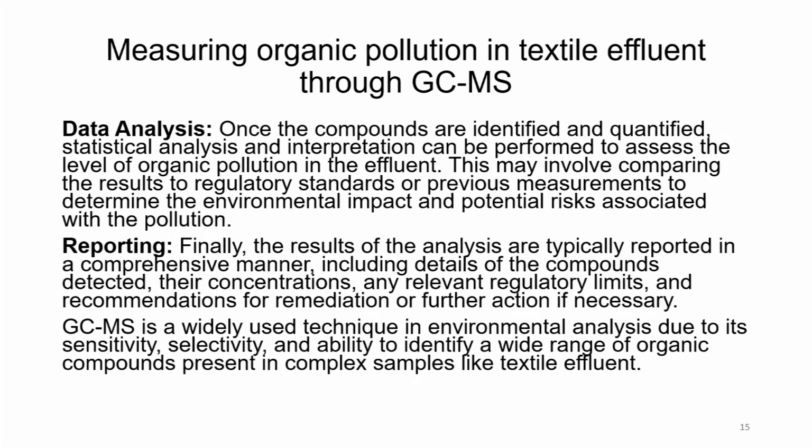Data analysis. Now, this is very crucial for interpretation of the mass spectrum. Once the compounds are identified and quantified, statistical analysis and interpretation can be performed to assess the level of organic pollution in the effluent.